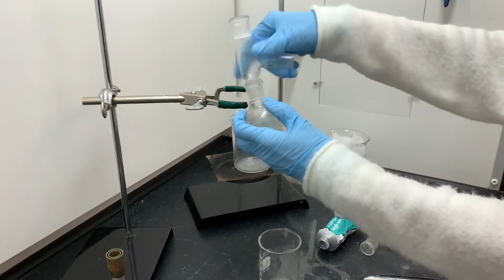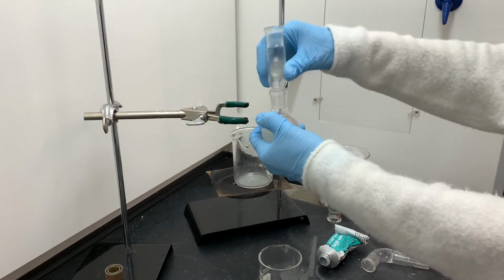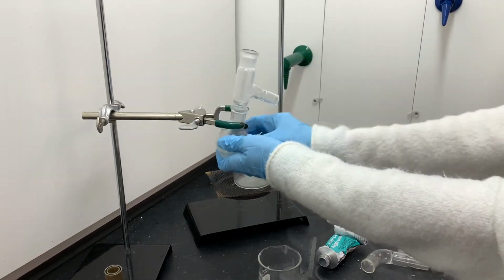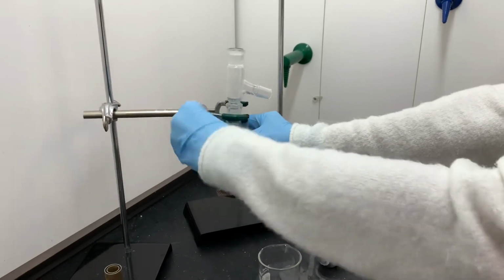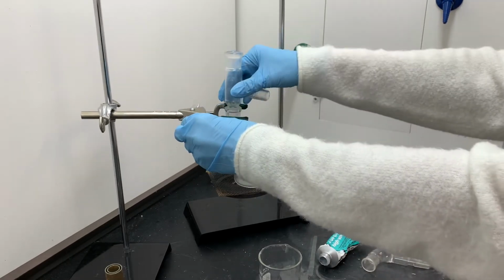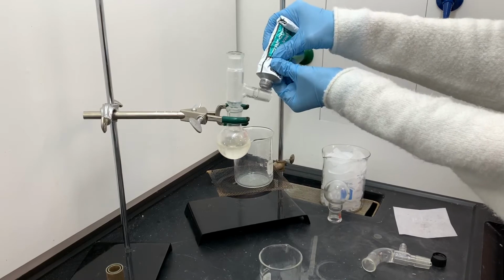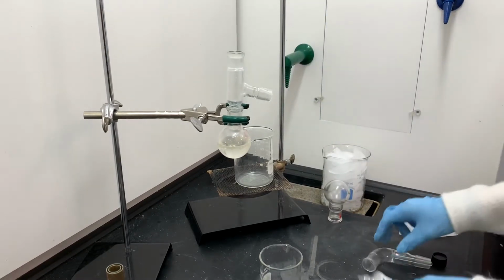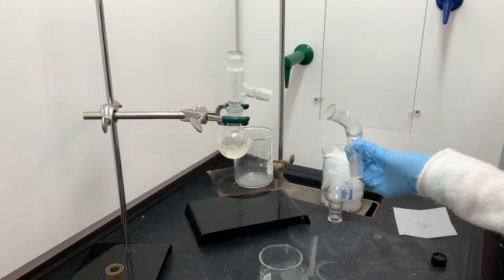Now, one of the challenges of assembling the glassware for this particular reaction is that I'm not going to be able to use Keck clips at all. The Keck clips are those little blue clips that help hold the pieces of glassware together. The reason for that is that I'm using a Bunsen burner, a direct source open flame, and the Keck clips don't hold up to that much heat, so they just melt. Because I'm not using the Keck clips, I'm going to make sure that I have maybe a little bit extra grease to help hold the glassware together.